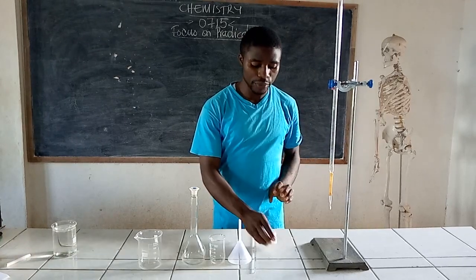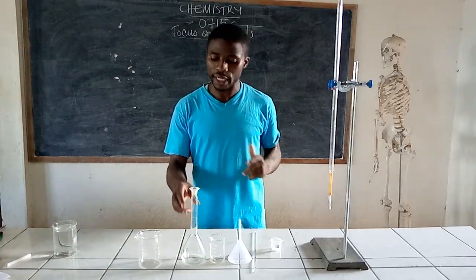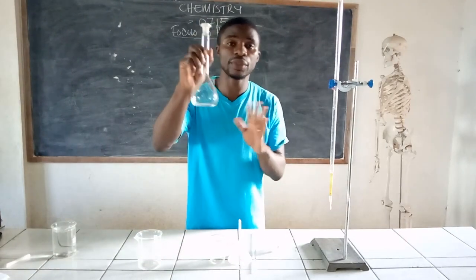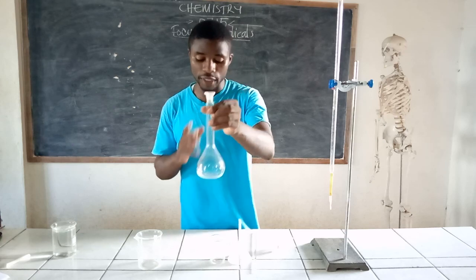First, you have to clean your equipment and rinse them with distilled water only, especially this equipment. Nothing should ever touch this equipment apart from distilled water in the course of cleaning or rinsing it.